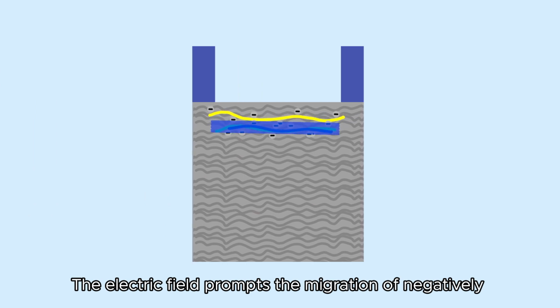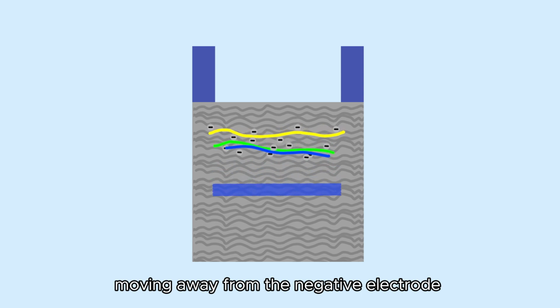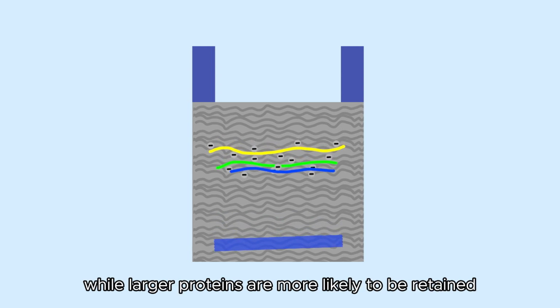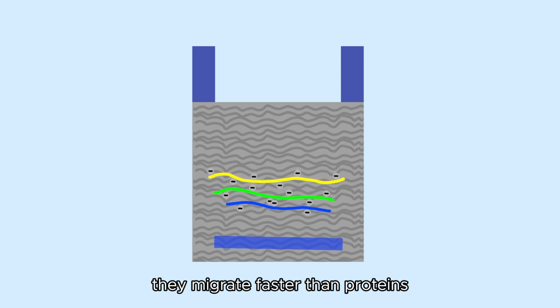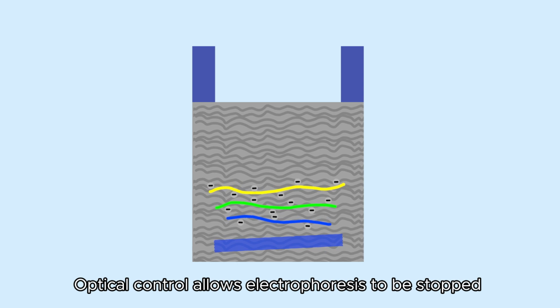The electric field prompts the migration of negatively charged proteins through the gel, moving away from the negative electrode towards the positive electrode. Smaller proteins easily traverse the gel's mesh, while larger proteins are more likely to be retained, resulting in slower migration. Due to the small size of bromophenol blue molecules, they migrate faster than proteins. Optical control allows electrophoresis to be stopped before complete migration through the gel.